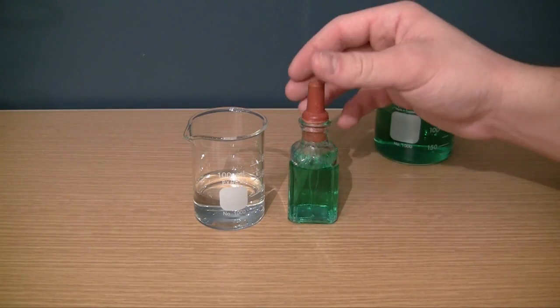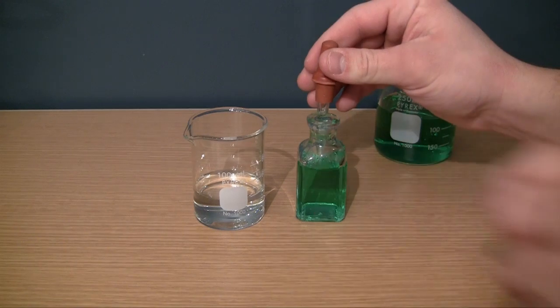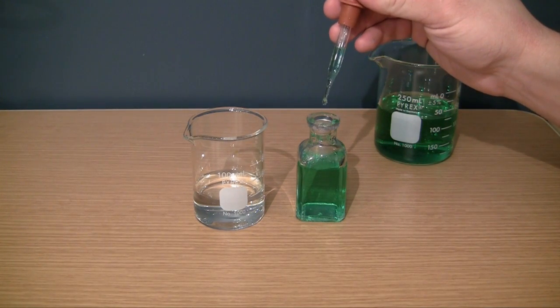Now some people actually call these dropping bottles because well for obvious reasons. Drop, drop, drop, drop, drop.